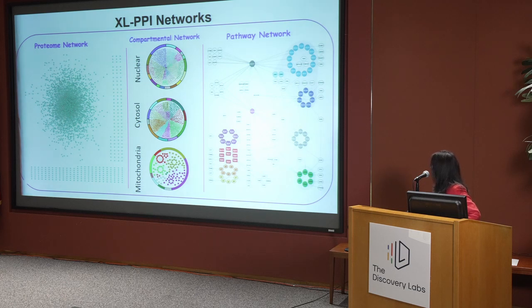And in addition, we can zoom in to identify the cross-link interaction network in specific pathways. For example, here showing the ubiquitin proteasome system, the 26S proteasome, and also its interactors and regulators, as well as the ubiquitin machinery. So this will give you a global view to see how the network changes under different conditions when you do system-wide proteome analysis.